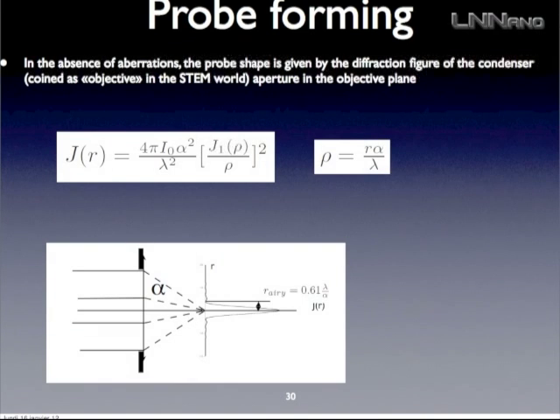So there is a mathematical formulation for this that I give it to you, and the only point that we really want to remind is that if you were in a perfect world where the objective lens would have no aberration, where you could have an infinite intensity with an infinitely small source, then the limit in the size of your probe, the distance between the maximum and the first zero, will be inversely proportional to the maximum angle of incidence, and proportional to the wavelength of your beam.